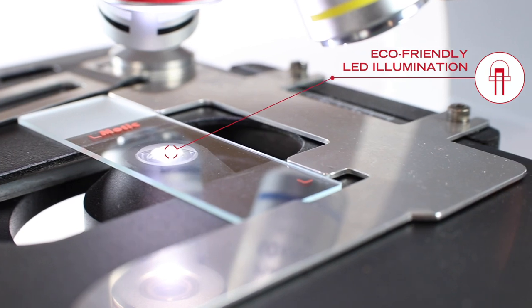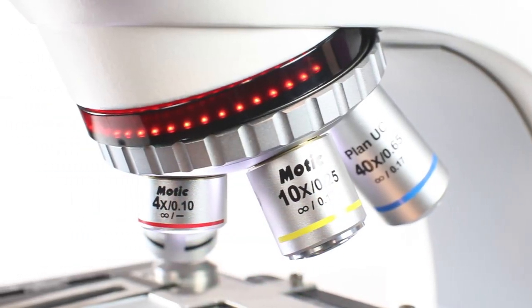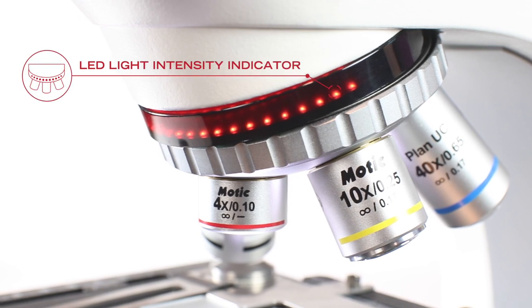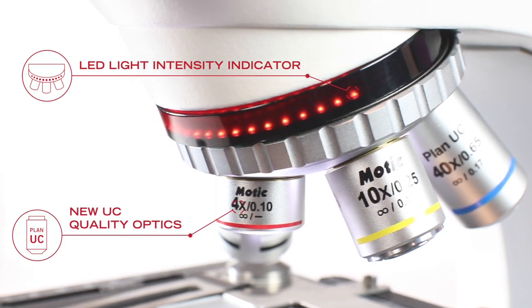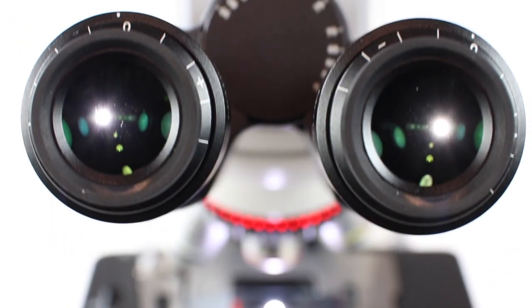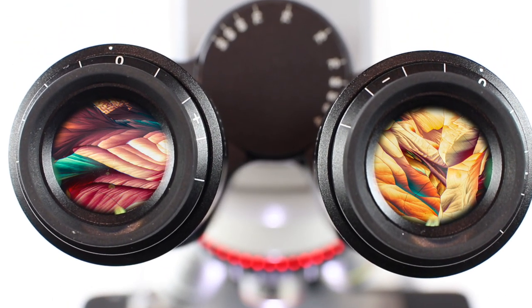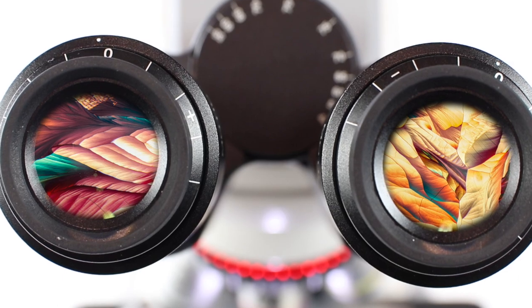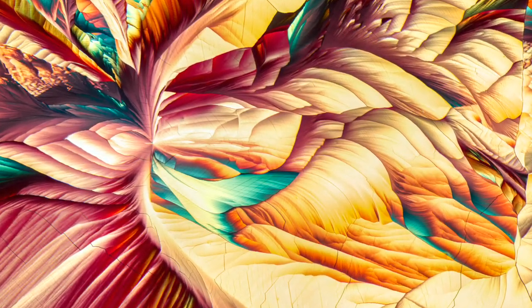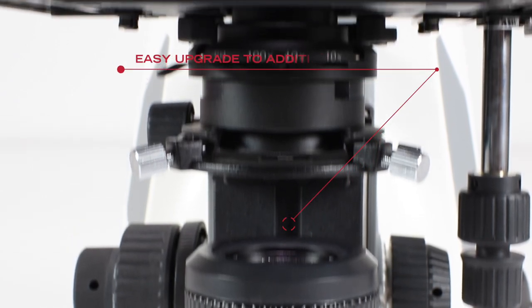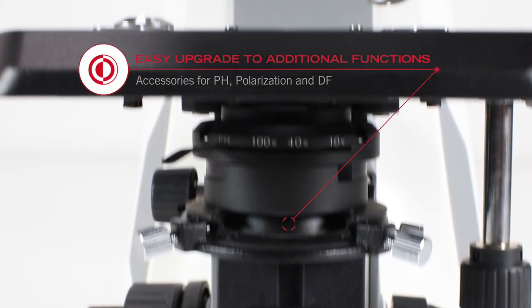Panthera E2 and C2 models are equipped with newly developed ultra contrast optics and additional glass elements, the key for overwhelming image quality in a field of 20 and 22 millimeters. Upgrade ability for diverse contrast methods granted for many years.